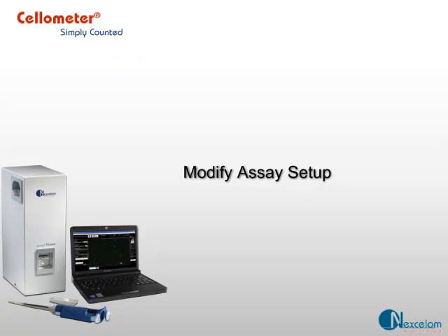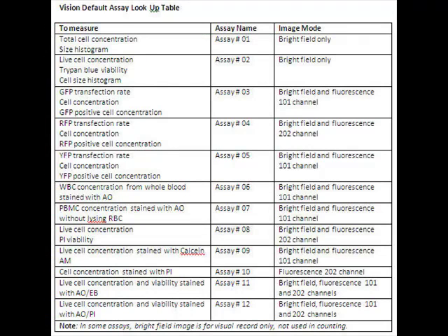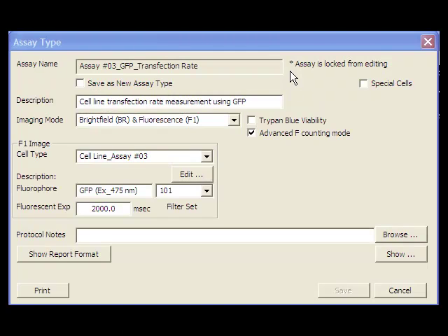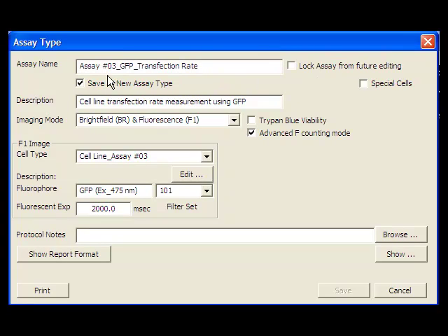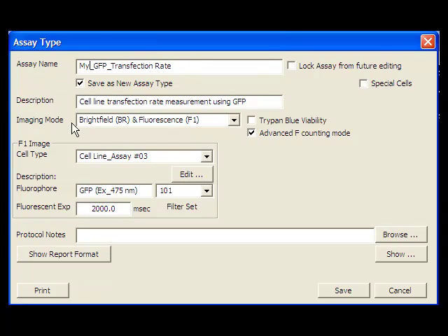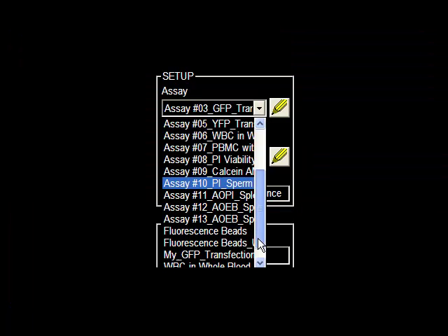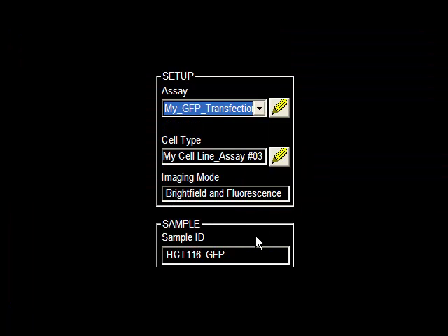To set up your own assay, the best method is to modify an assay from Nexalam's preset assay list. Preset assays are locked from editing. First, save as a new assay type. You can then change exposure time and save. The new assay type shows up in the assay drop-down menu.